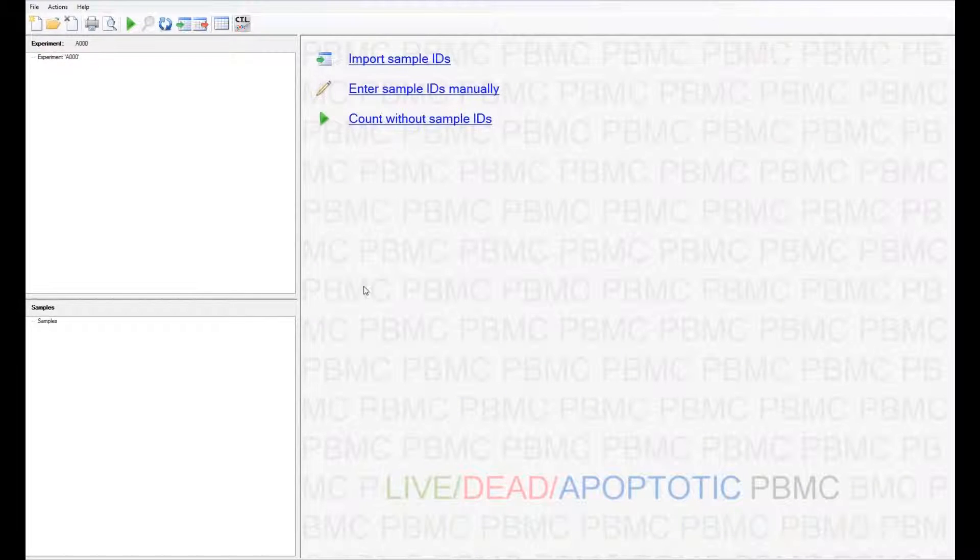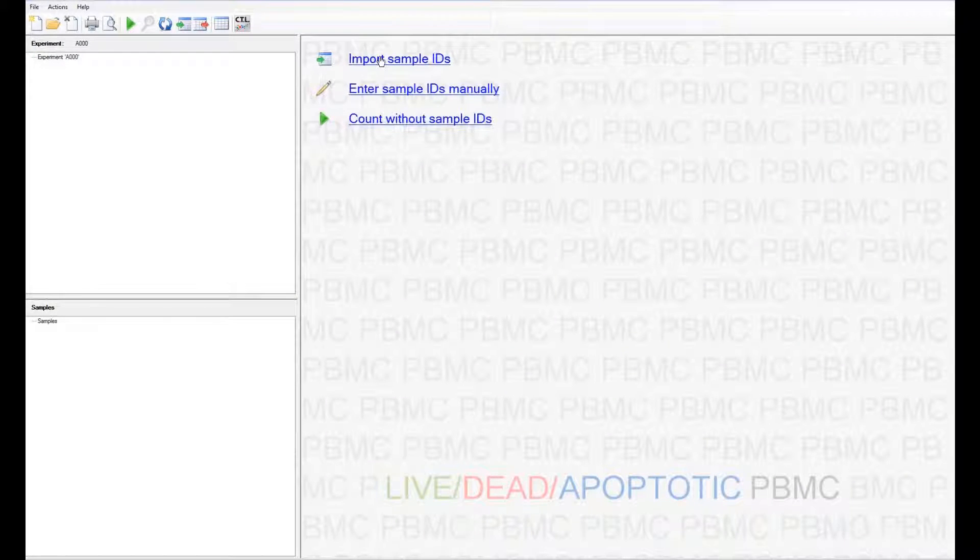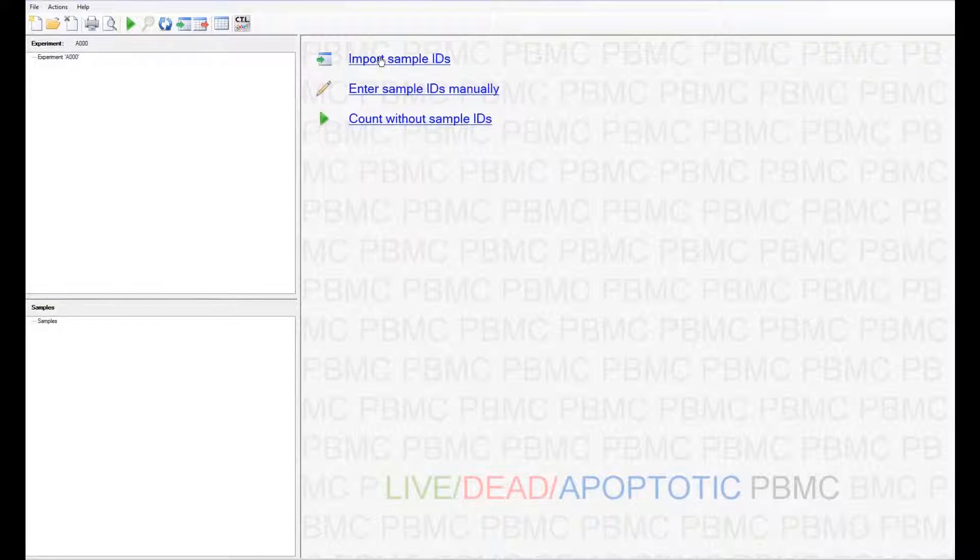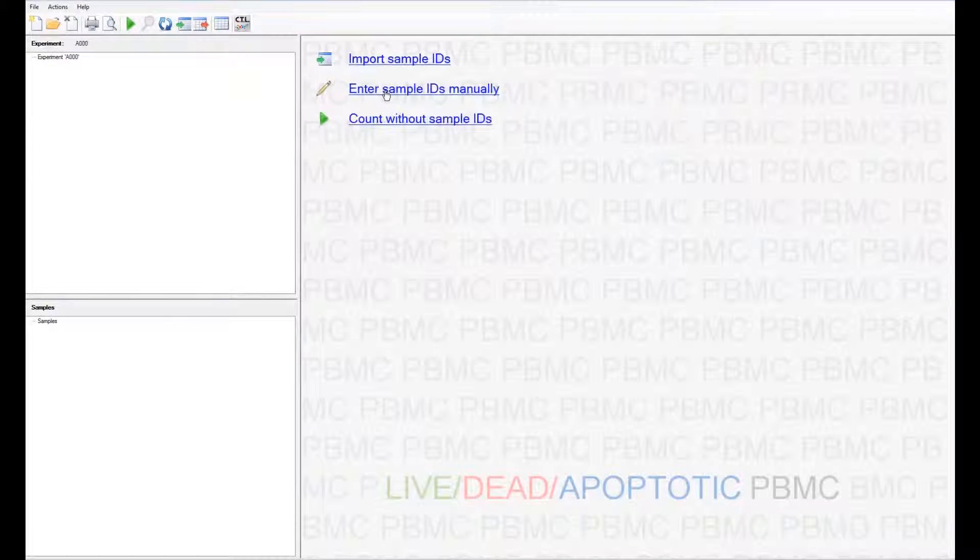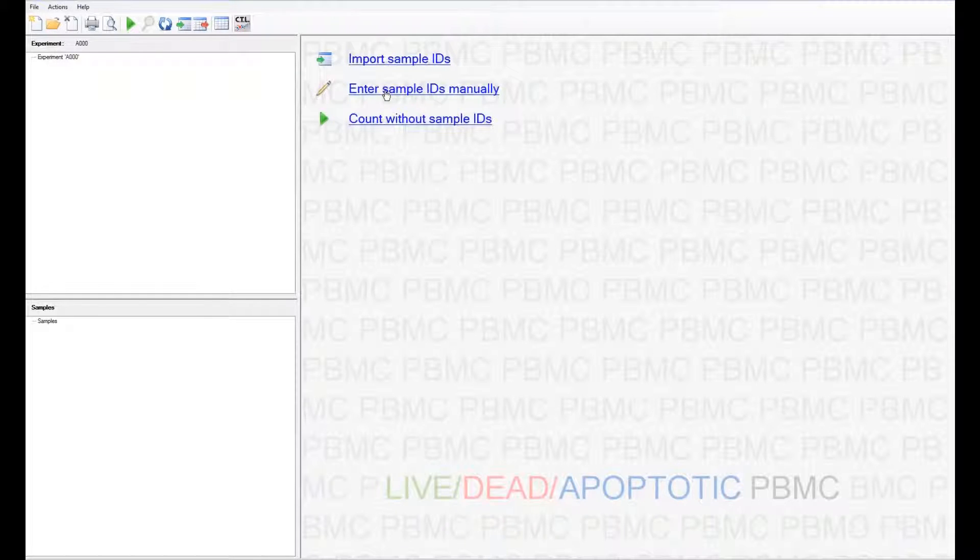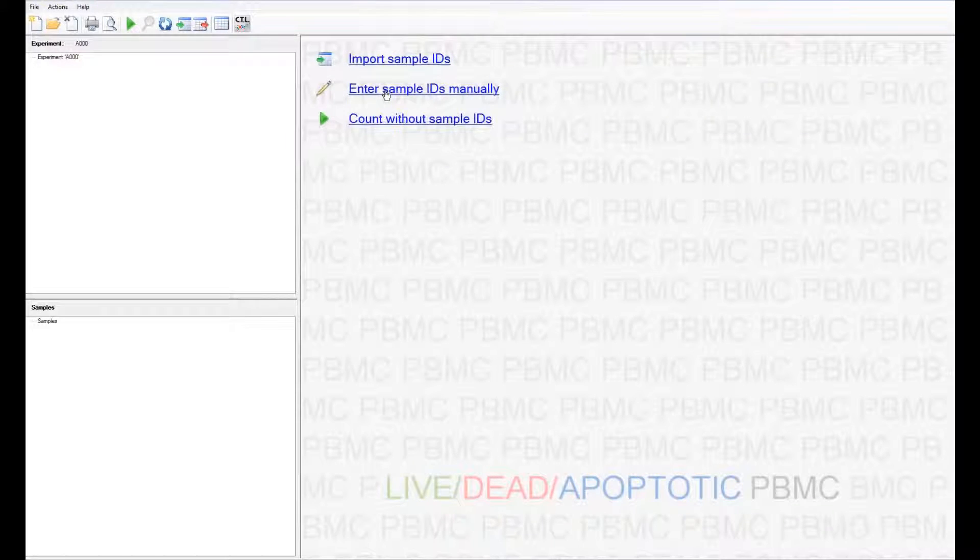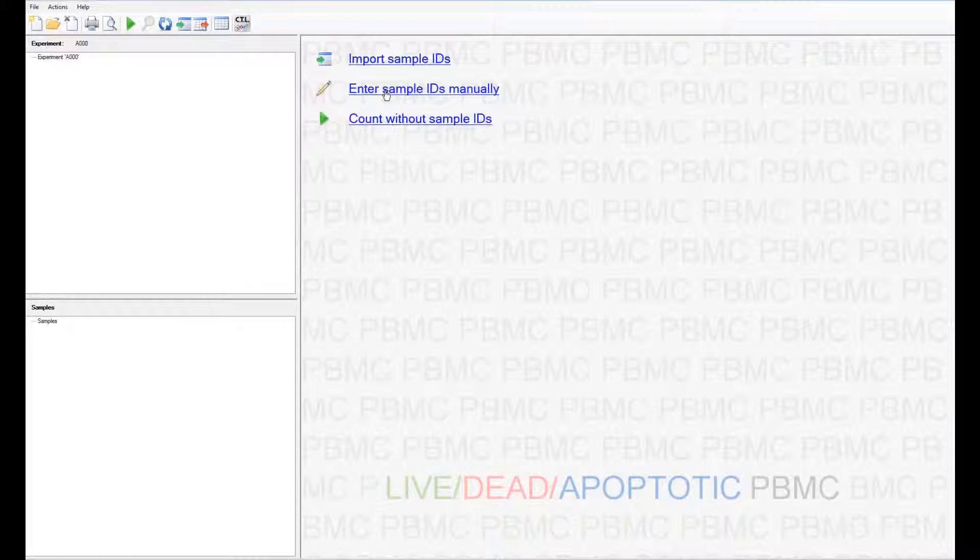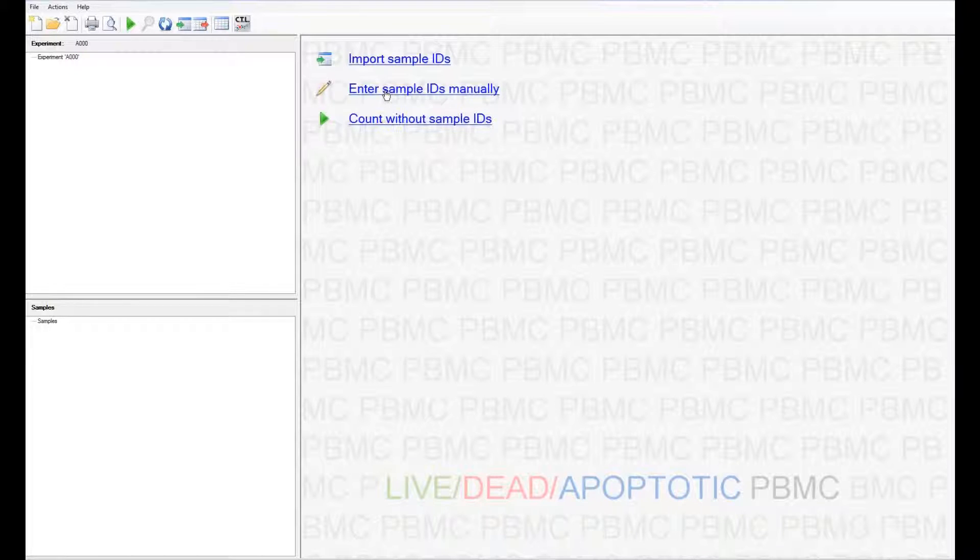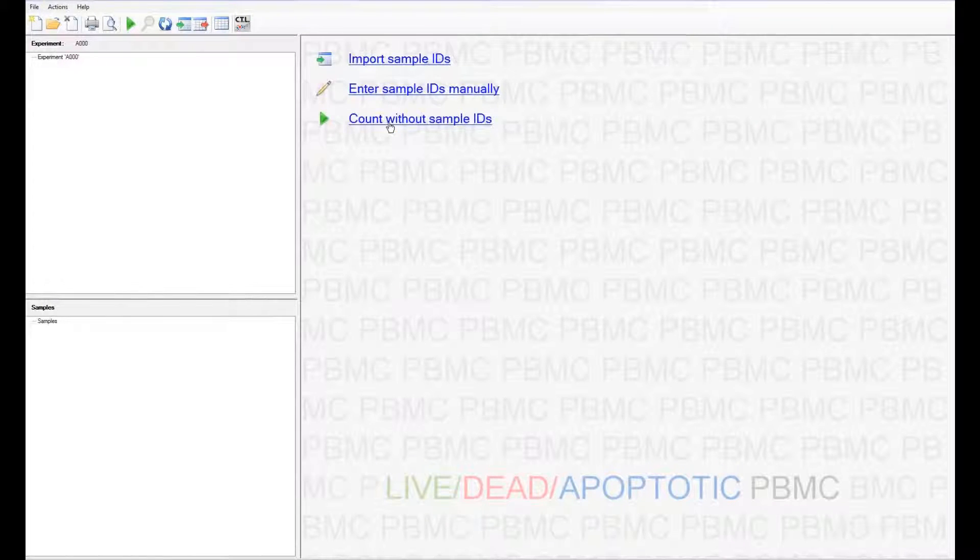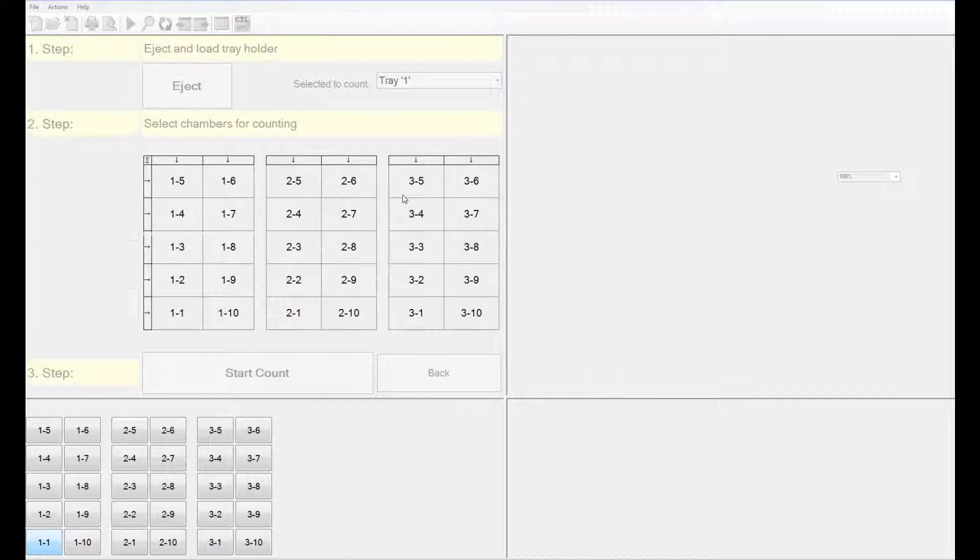The next set of parameters that you have to load are the sample IDs. They can either be imported from a CSV or an Excel file, or they can be manually entered one at a time. You have to remember that each chamber should have a unique identifier, even if you have repeats of the same sample. If you do not wish to have any IDs associated with the samples, you can also run a count without sample IDs.